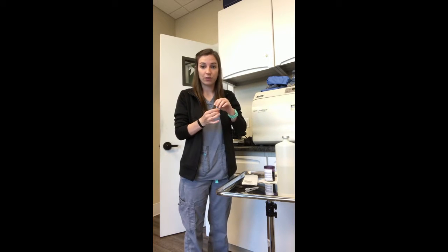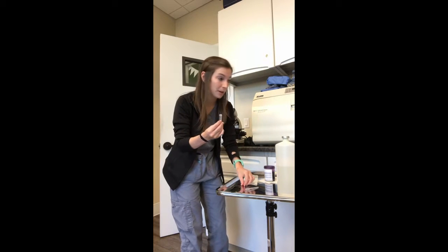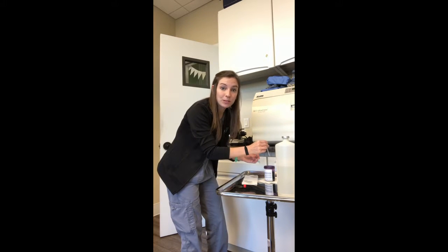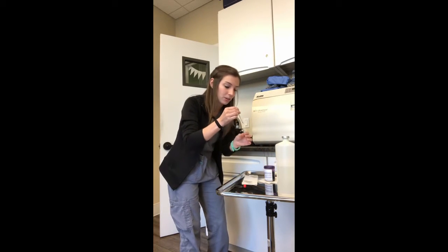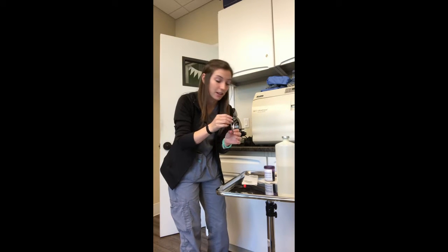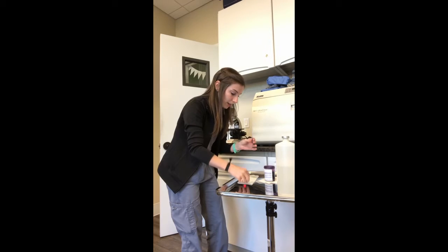I have received my sample that has been spun down through the centrifuge. I am going to pour off the supernatant, and then with what is remaining, I am going to place a drop of methylene blue stain in there. I will use my pipette to mix it up, and then place a drop of it on my slide with a cover slip.